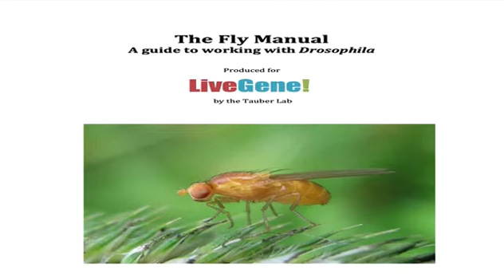With our fly manual, now taking a look at this electronically. You will of course find the entire fly manual at your disposal for reading on our Canvas page. It's fairly detailed, especially if you want to get into fruit fly biology, which is a huge field of research. But today I'll emphasize some of the pieces that you'll need in order to work in our lab.